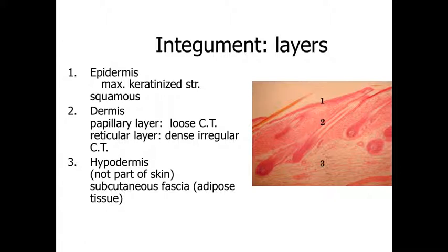Scattered among both the epidermis and the dermis are going to be those specializations we talked about, these modifications. In this case, we've got hair shafts, which are going to be present here. So you can see the hair shaft, you can see the hair follicle, the structure associated with this, the hair bulb over here at this point. Now, in most cases, these specializations associated with the skin are going to be structures that are continuous with the epidermis. And so if we trace this hair follicle around, we can see how it's essentially continuous with the epithelial lining of the epidermis.